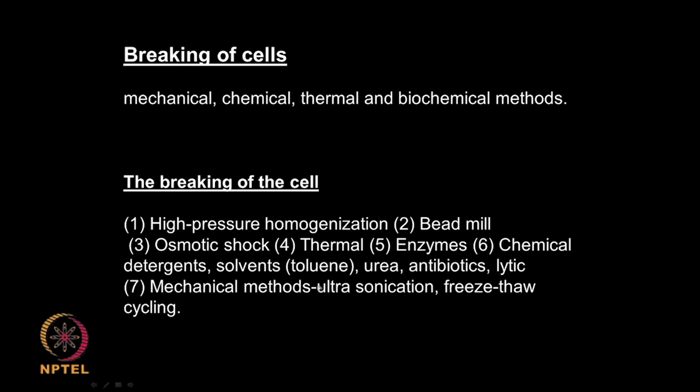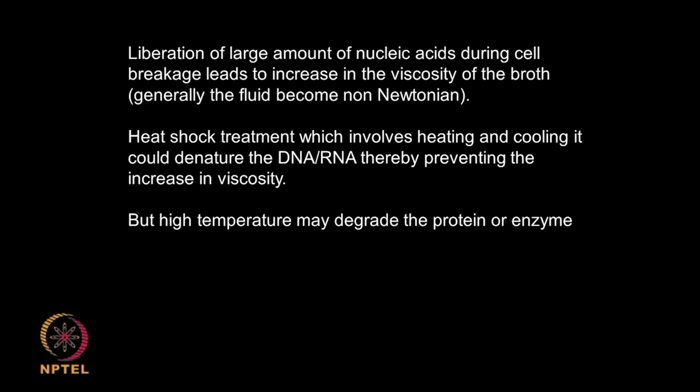So, there are a large number of methods available, and some of these methods are for laboratory use and some of the methods are for large scale plant use. So, we will briefly touch upon each one of the methods. Okay. Now, a lot of nucleic acids may be liberated when you break the cells. So, obviously they will increase the viscosity of the broth, and then your broth becomes a non-Newtonian liquid.